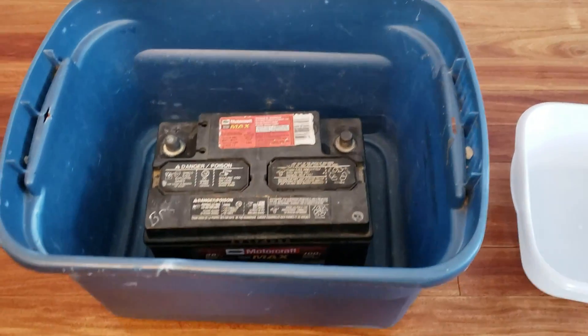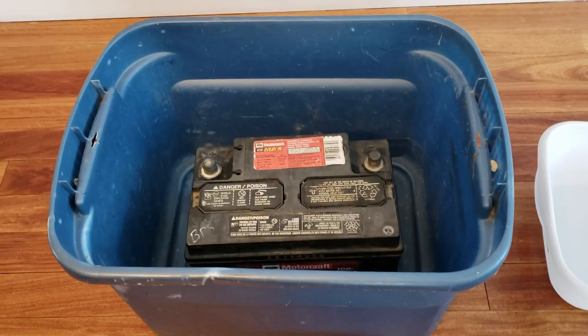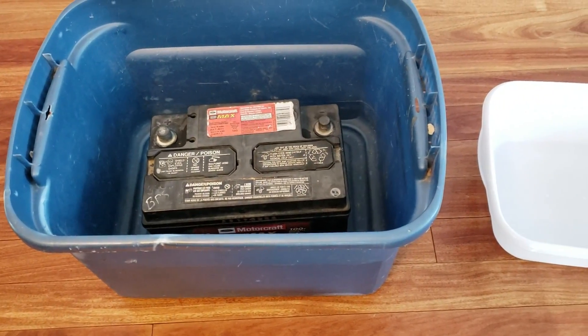Hello, my name is Levi, and today I will show you how to get sulfuric acid from a car battery.